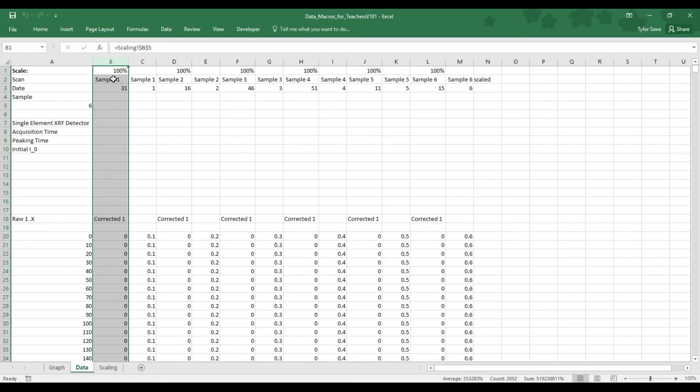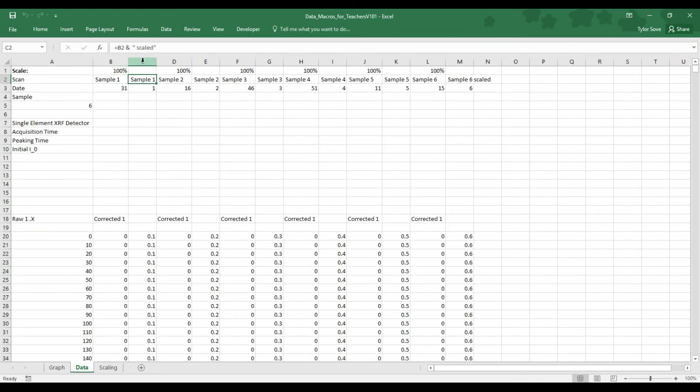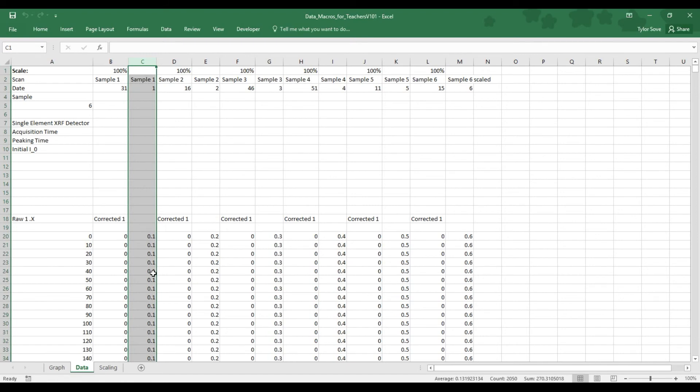But, for sample 1, we can see all of its data is down here. Down over here in column C, we again have sample 1, but this time the numbers have been scaled, normalized, and offset. As we can see, it has an offset of 0.1.